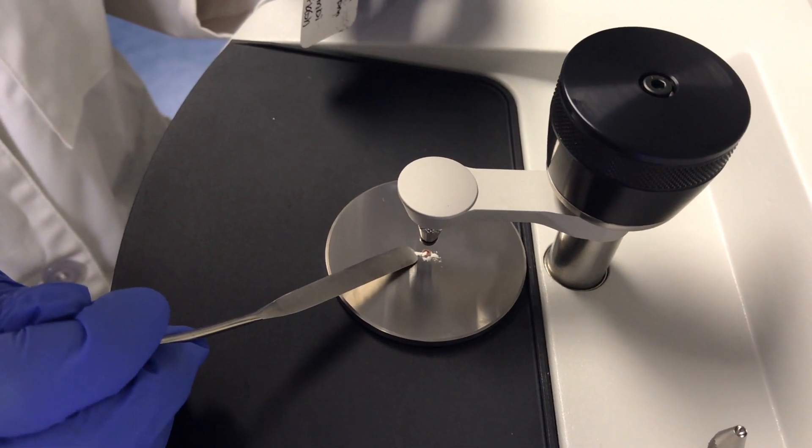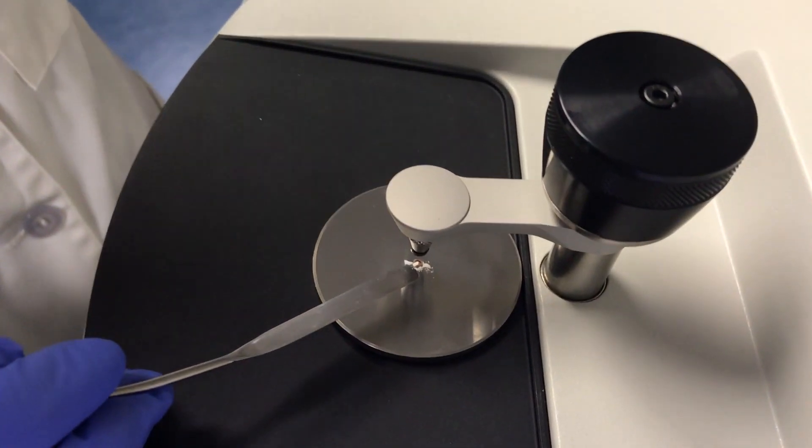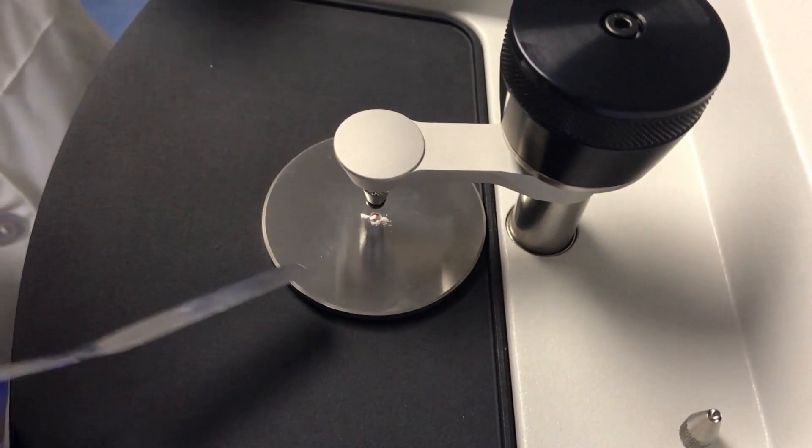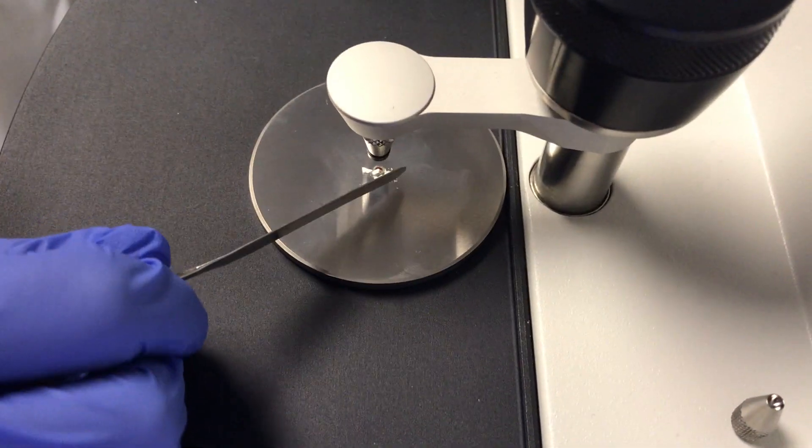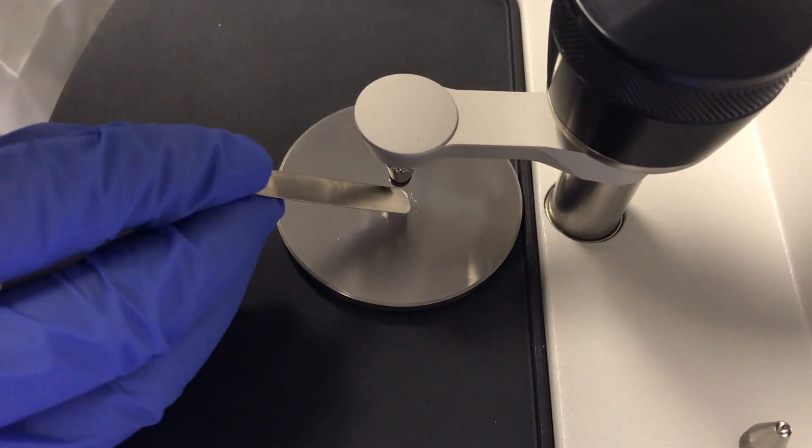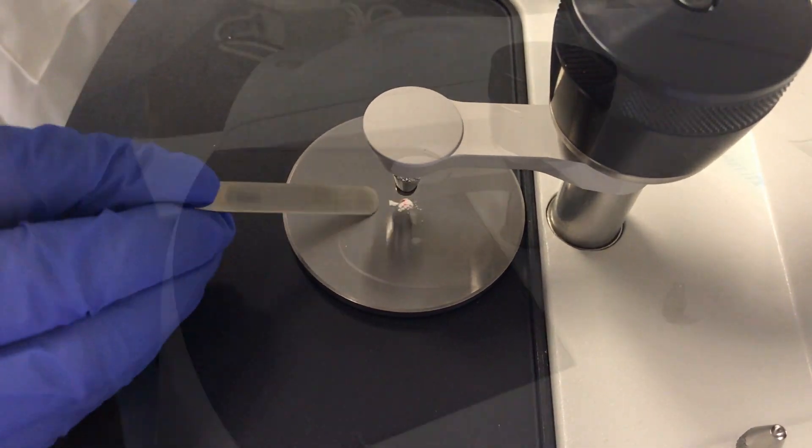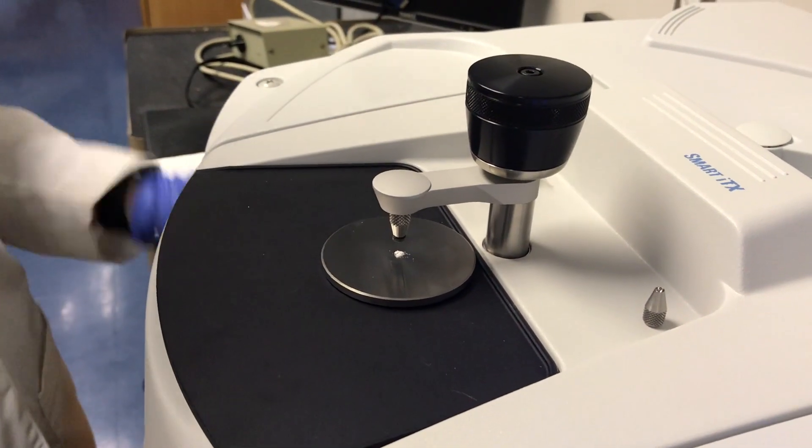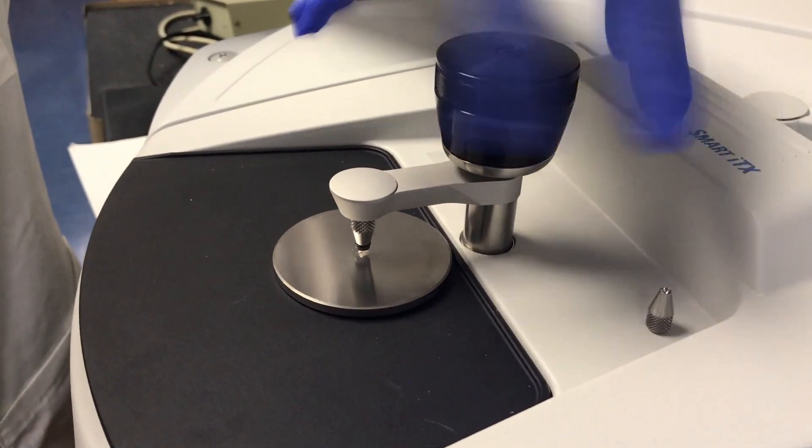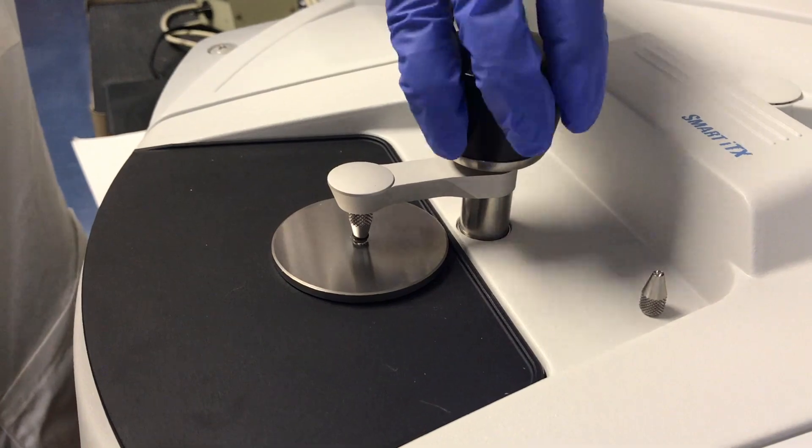The most important thing is that you cover the entire crystal but that you don't touch the crystal with the spatula. Once you're done with that, we're going to close it and wait for the click.